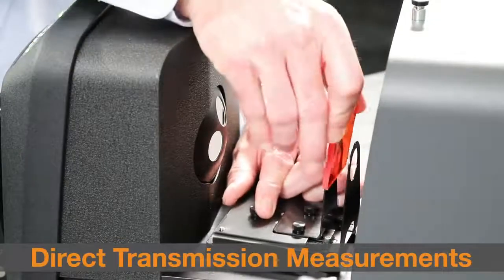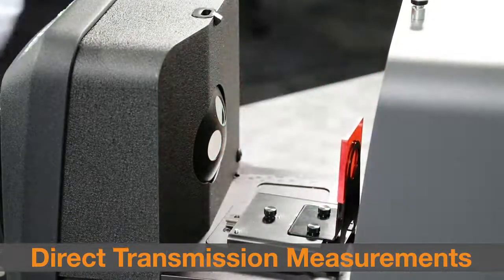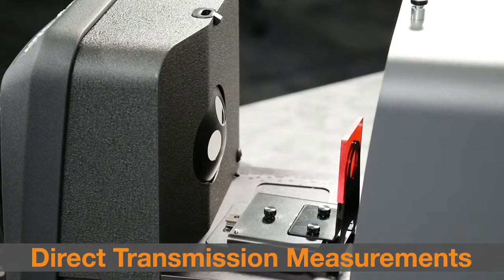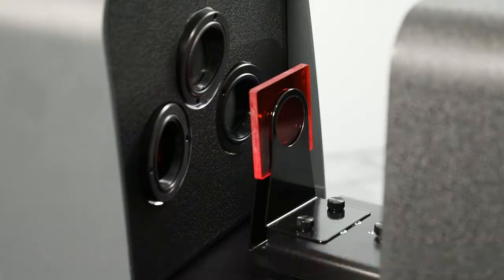Direct transmission is appropriate for measuring transparent samples which exhibit no scattering of light, such as samples colored with dyes rather than pigments. These measurements are taken with the sample positioned towards the lens in the back of the instrument. When performing direct transmission measurements, only the 25mm clamp, stop, and aperture plate should be used.